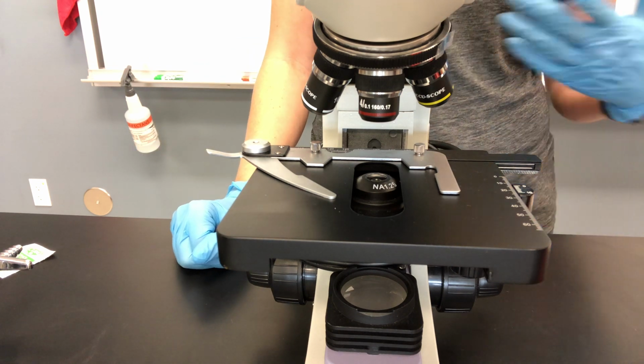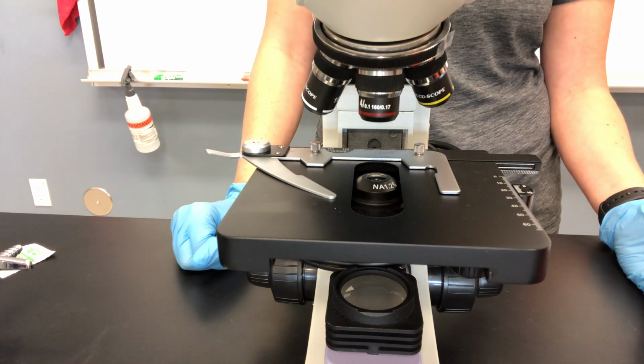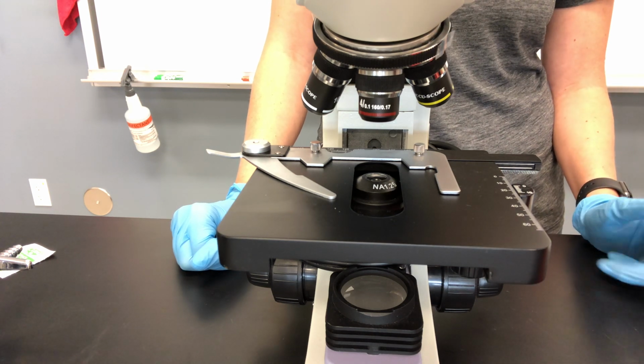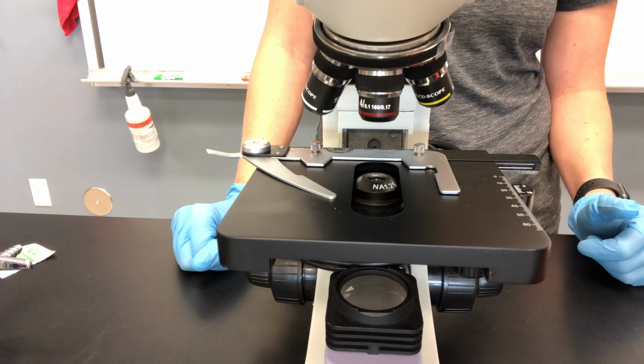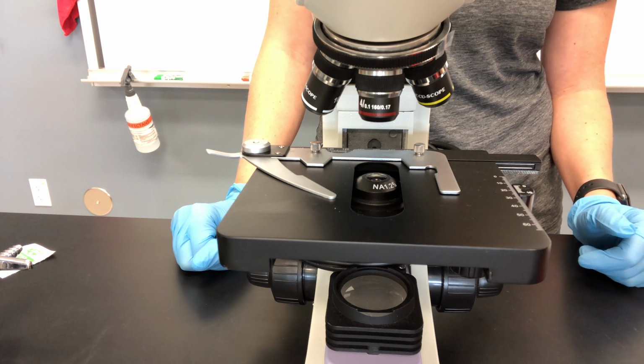All right, so today's lab for the microscopy is just getting familiar with how to use a microscope, making sure you can use both oculars, and learning how to do oil immersion, and then you'll be taking a look at some living specimens, maybe some pond water or some living bacteria.